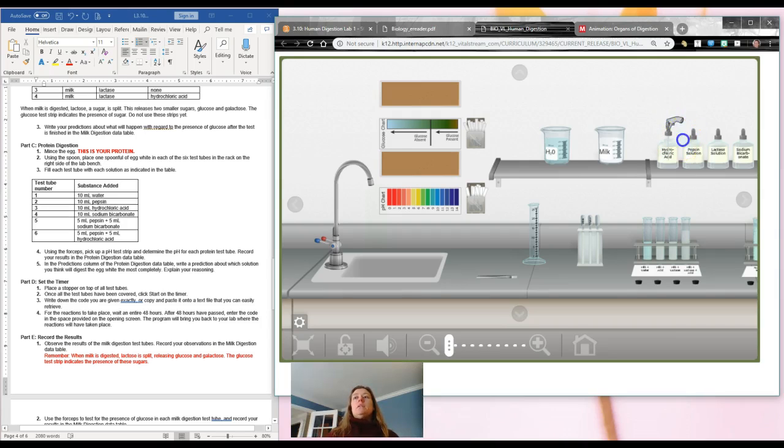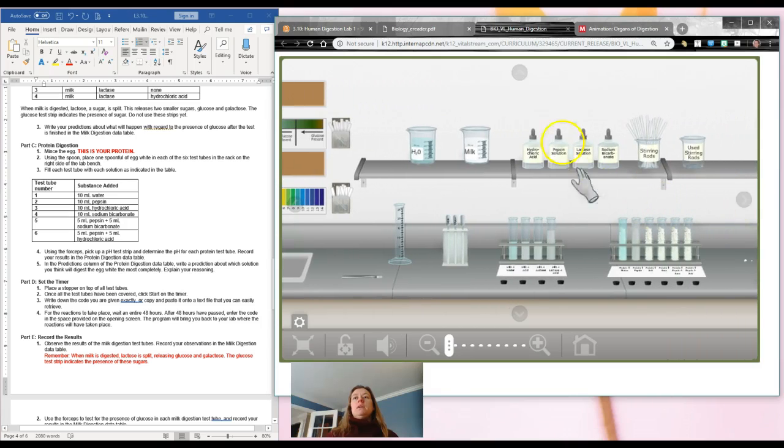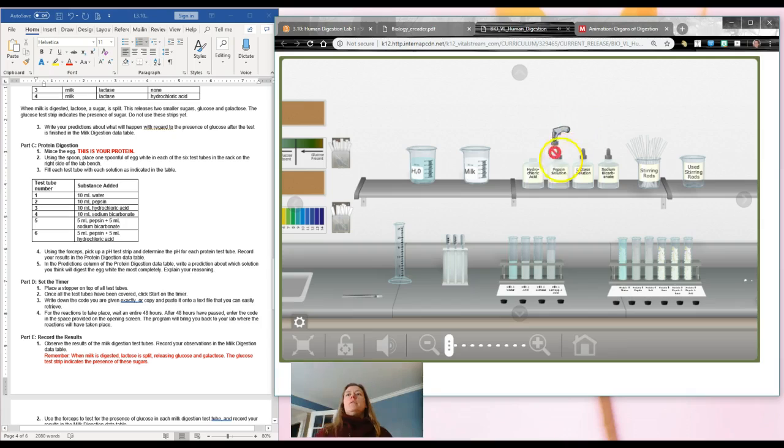Now, I'm going to make a little shortcut here. Just bear with me. I just put 4 of these into this graduated cylinder in order to make 10 mils that I could later pour into here. So I'm wondering if it'll let me take a shortcut and put 10 in here. So that's 1. Okay, good. Count with me. 2, 3, 4. All right, and we're going to put that back.